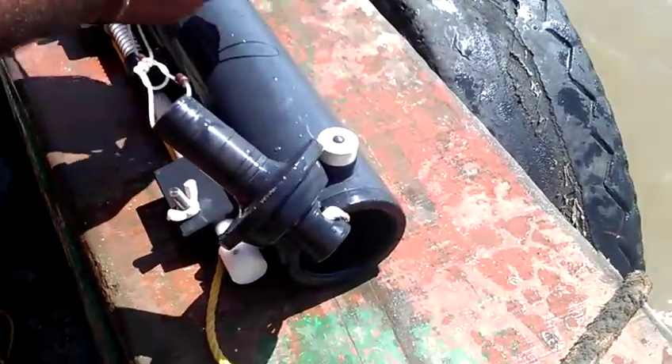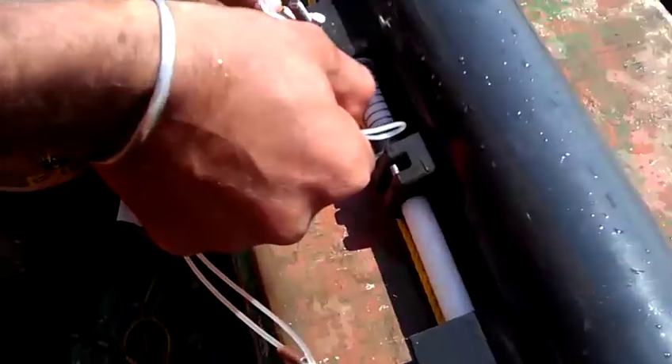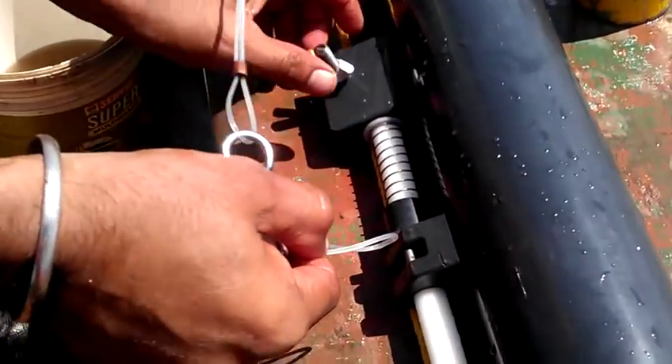First you have to open the caps. This is the Niskin water sampler. Then you have to put the locks like this.